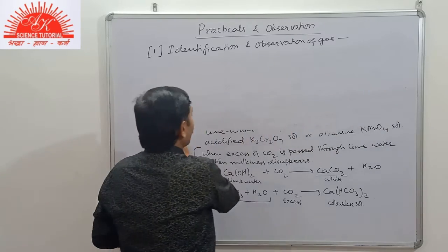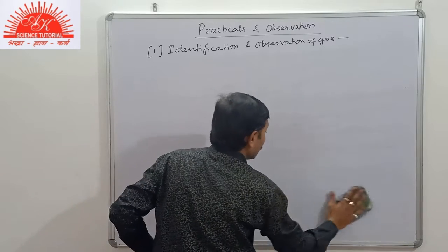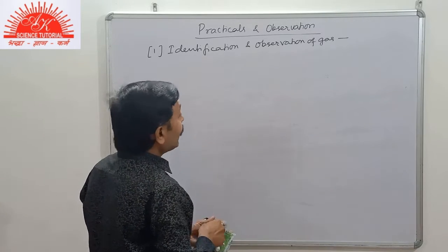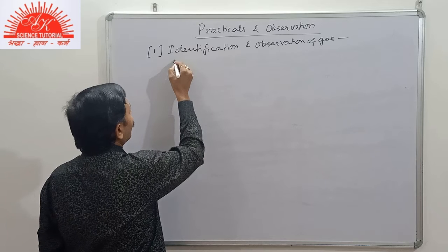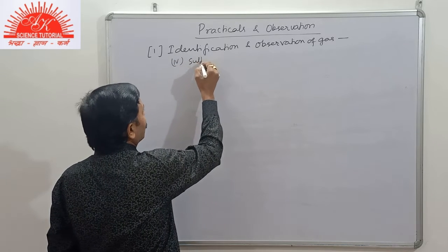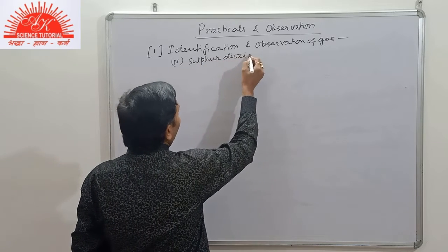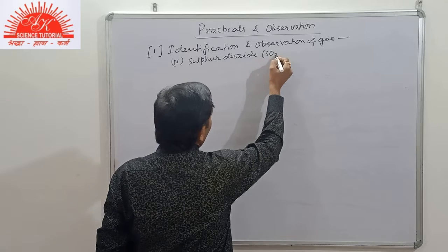So now the next gas. The next gas is sulfur dioxide, that is SO2.